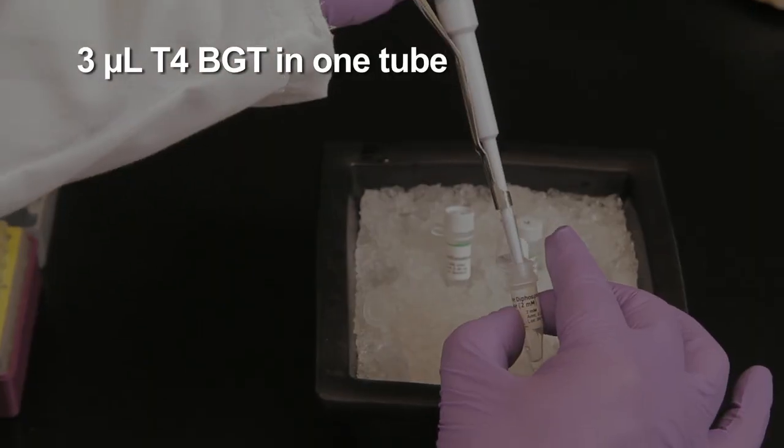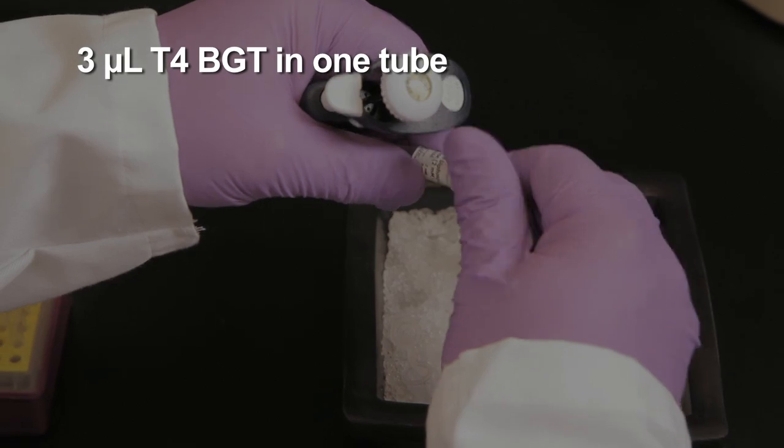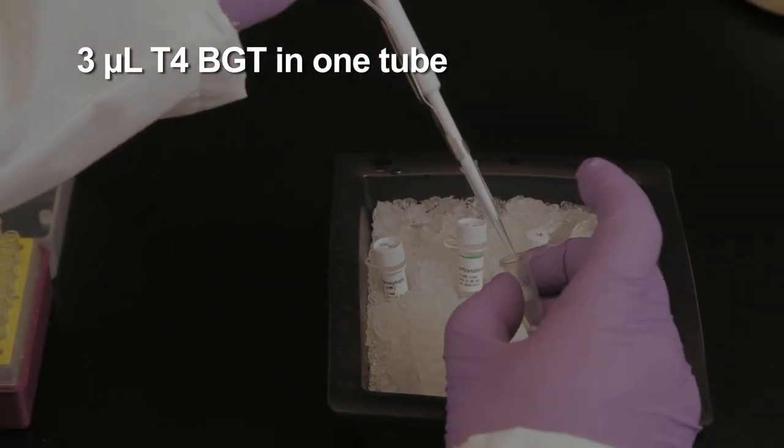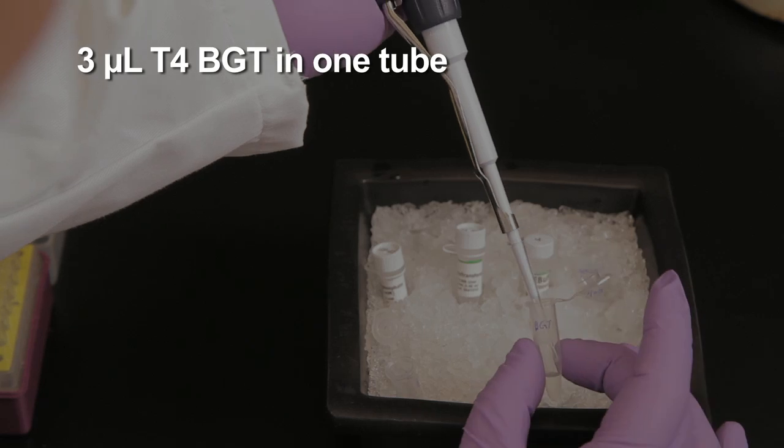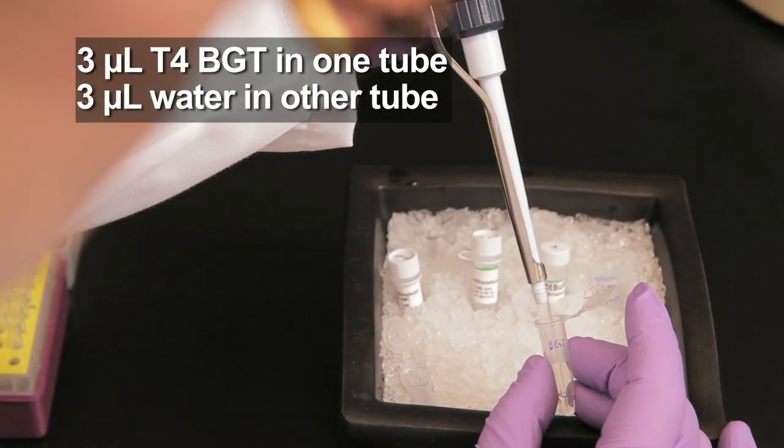Then add 30 units, or 3 microliters, of T4 beta-glucosal transferase to one tube. Mix well by gently pipetting up and down. Do not add the T4-BGT to the second tube as it is the control reaction, but be sure to add 3 microliters of water.